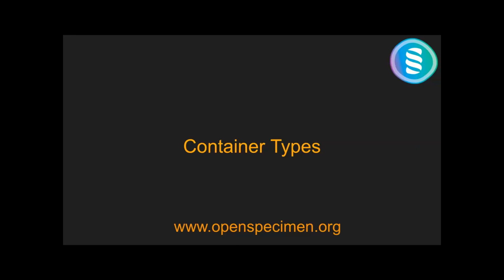Okay, so we just saw all the prerequisites. To re-summarize, we need to know all the dimensions, the naming convention of the container, and what type of restrictions I want to add within a container or a freezer.